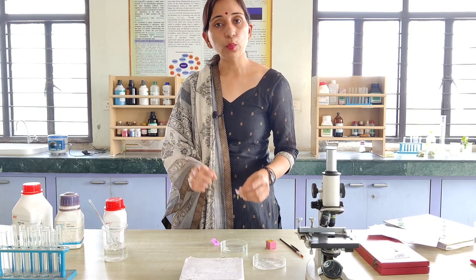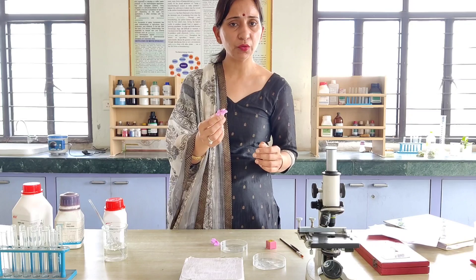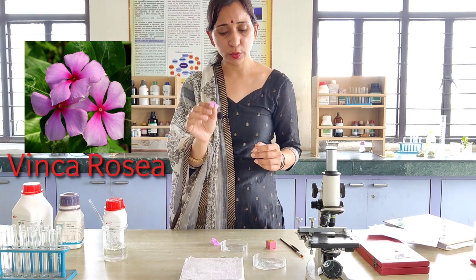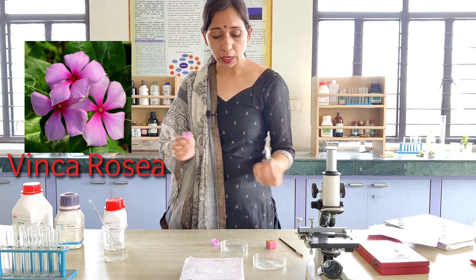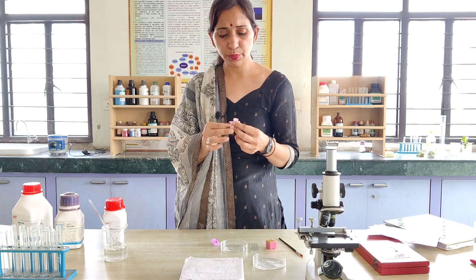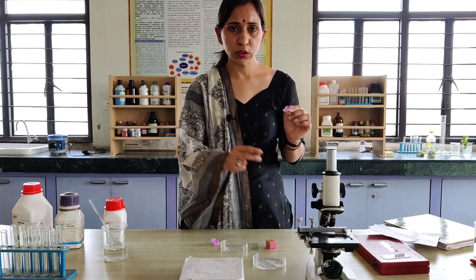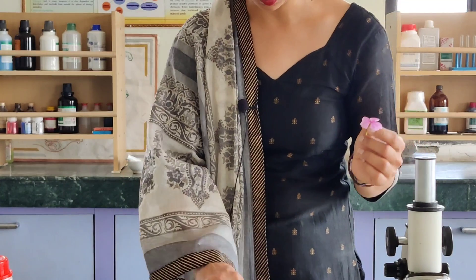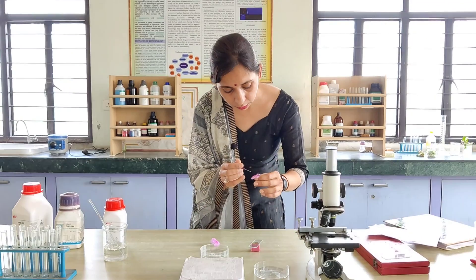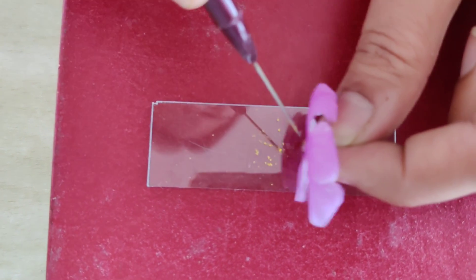Now for this experiment we require pollen grains. This is an experiment for pollen germination, so you can choose any flower. Let's try it — now we will extract the pollen grains from the flower.